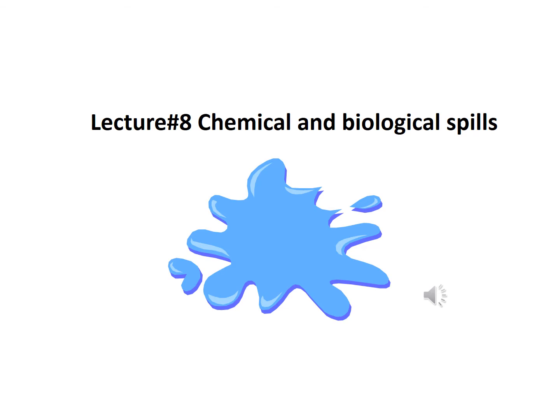In today's lecture, we will discuss different types of spillage, chemical and biological spillage. Spillage is a very common phenomenon. It happens while you are working in the lab. This is routine work, and there are chances, intentionally or unintentionally, that some chemicals can spill.